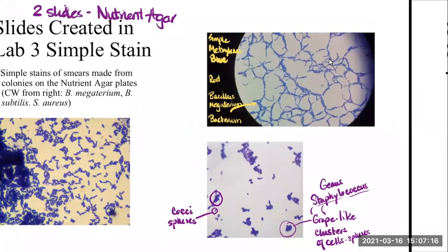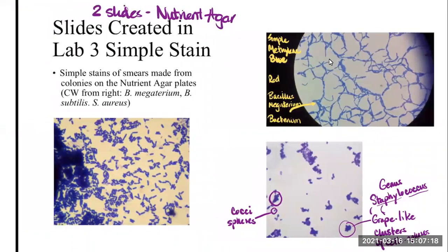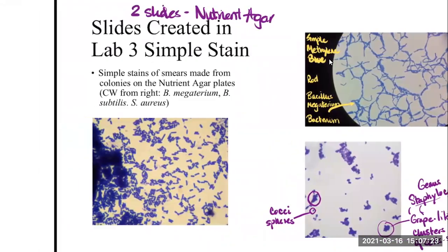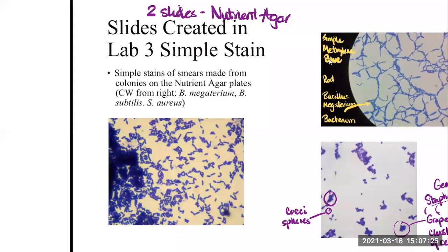That one in particular, I know is Staphylococcus aureus. So that one is Staph aureus. And then, oops, I think I have these in the wrong order.